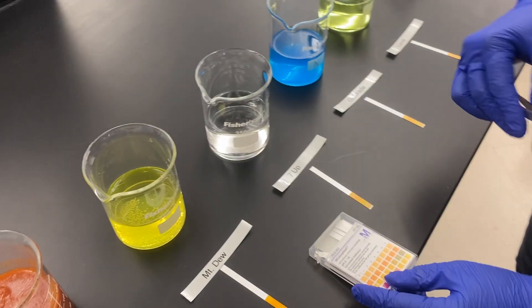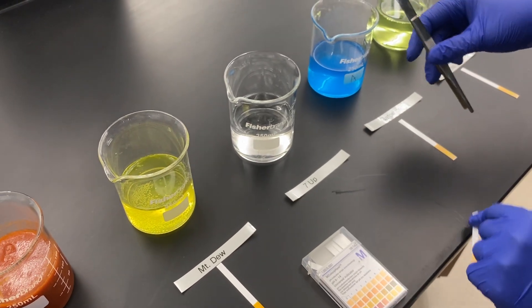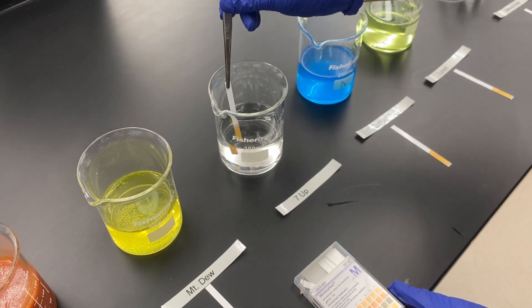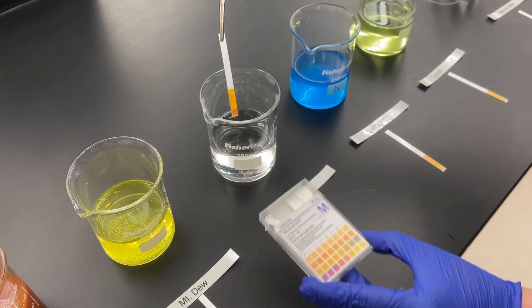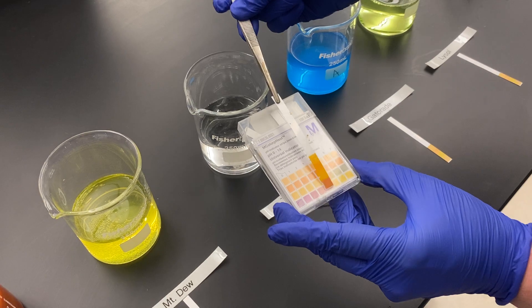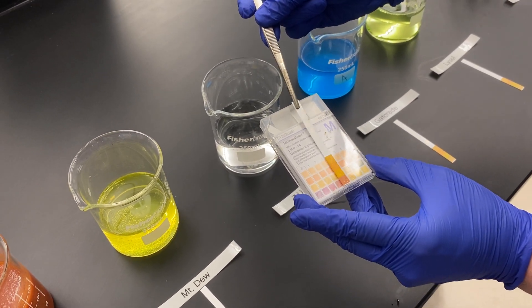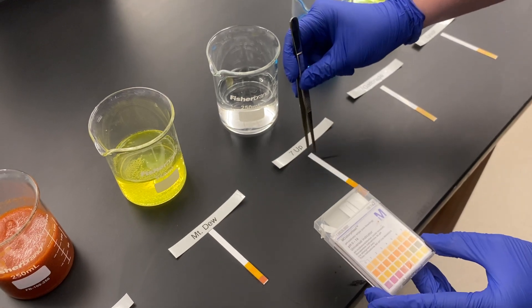Next we're going to test 7-Up, which is a different type of soda, to see if it's the same. Sure enough, this also comes out at about a pH of 3. So generally sodas are quite on the acidic scale.